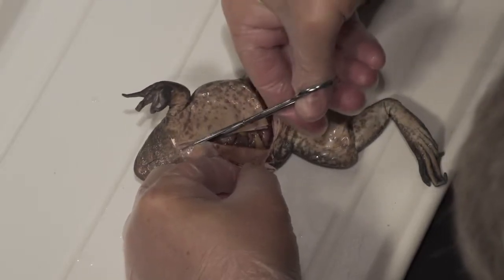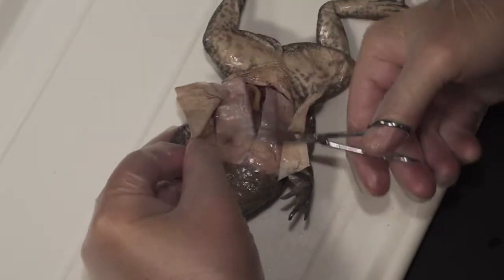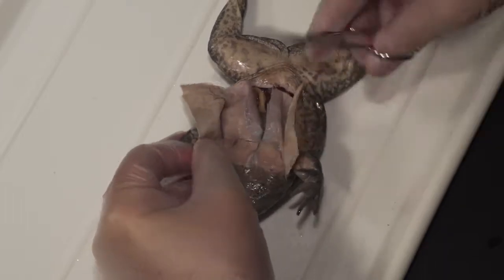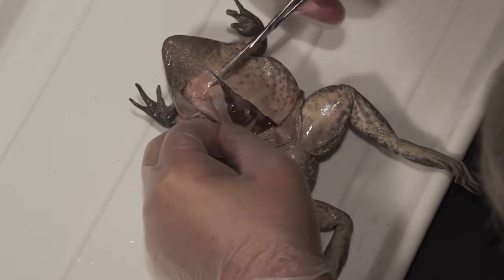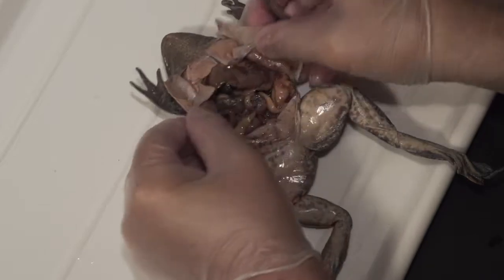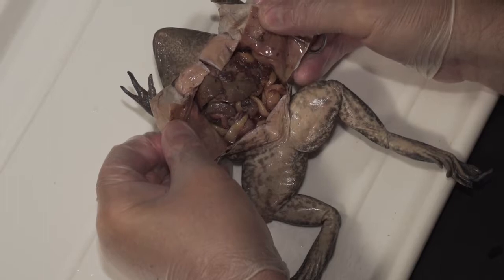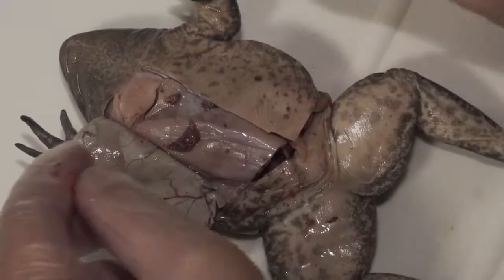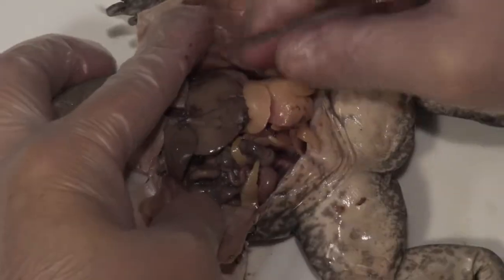Cut until you get to about where you can feel the bone up there — you can cut through that, or leave it for now. Then cut out toward the arms to create a flap. Now you can fold all that back and expose the internal organs of the frog. You can see the liver right on top. We've cut our flaps of skin and muscle back and exposed the abdominal cavity.